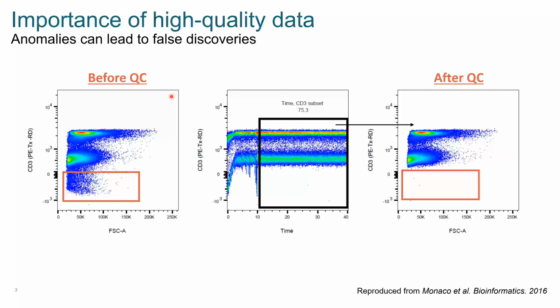And here they're showing an example of flow cytometry data. Here we're looking at CD3 signal over forward scatter, and we can see that there's this CD3 dim population, right? So I might see this population unique to a couple of samples and might interpret it as a novel phenotype, and this CD3 dim population is somehow associated with control of an infection or a desirable outcome after some kind of treatment administration.